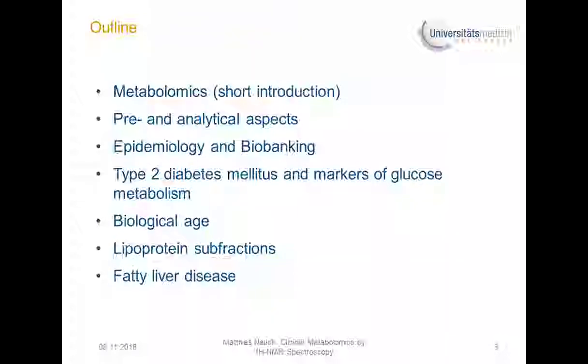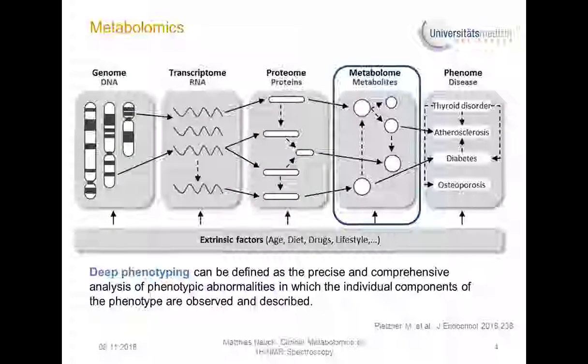In my talk, I will cover the topics metabolomics, pre- and analytical aspects, the epidemiology and biobanking. I will talk about type 2 diabetes mellitus and markers of glucose metabolism. I will talk about the biological age, lipoprotein subfractions, and fatty liver disease.